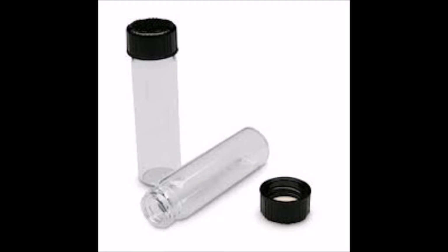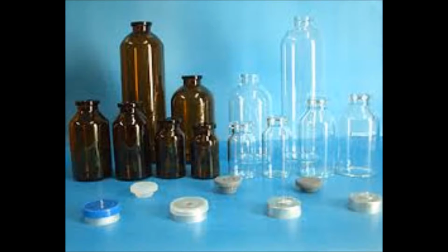Then, the solution was separated into 2 different vials, one for my partner and one for me. The crystals are currently sitting in uncapped vials so that the water can evaporate out around the alum. This slow, undisturbed process of evaporation means that the alum can bond to itself very slowly, giving it the time to create very organized and geometric patterns and, eventually, very pretty crystals.